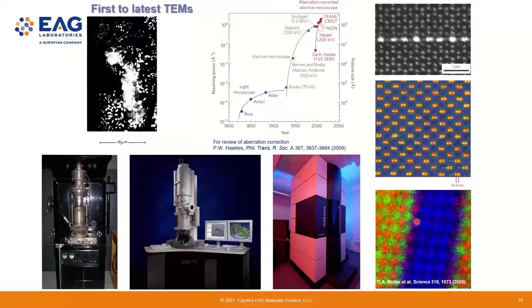What I always mention is that this kind of resolution can be readily achievable on commercial TEMs these days, but this does not mean your sample will have such high resolution. You always need to worry about electron beam damage, especially for some of the semiconductors. It's near impossible to get such high resolution. For example, on a silicon-silicon dioxide interface, the sample will be basically cooked.